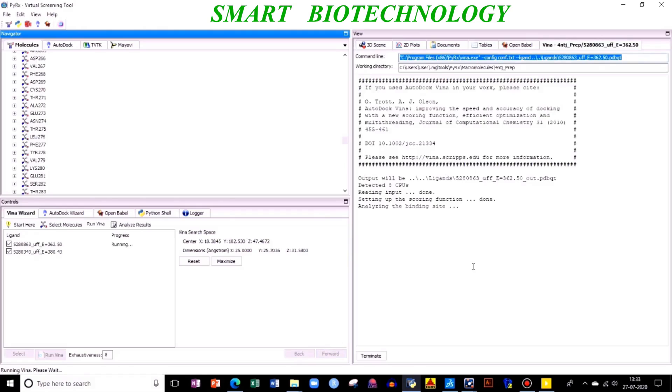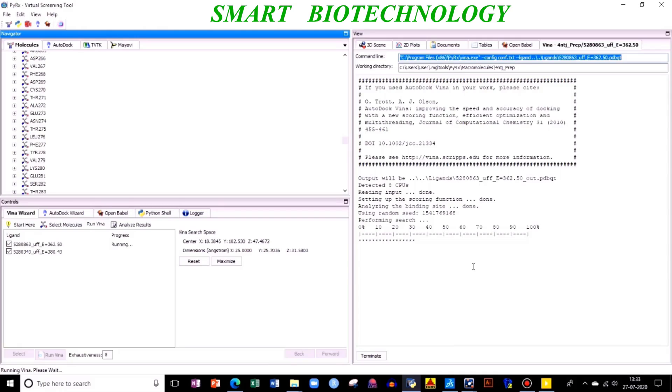Now your program will be running. It will take time depending on your protein and ligand size. I don't think this will take much time - within minutes it will happen. So we'll wait for this and we'll analyze the output also.